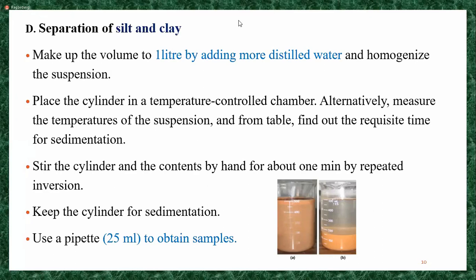One of you asked about the temperature part. Here I already mentioned that the viscosity of the dispersion agent will change with the temperature. So to maintain the viscosity, we have to maintain the temperature. That's why we have to maintain a constant temperature throughout all these procedures.